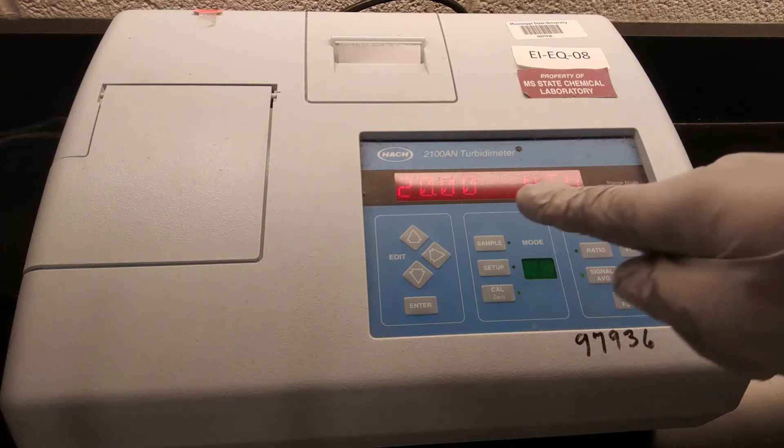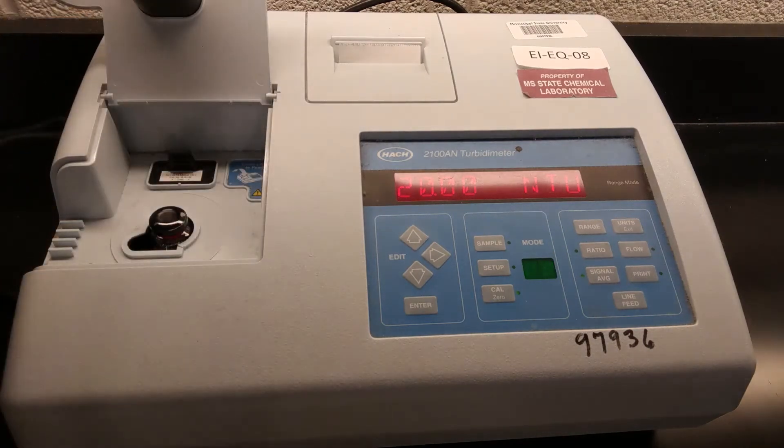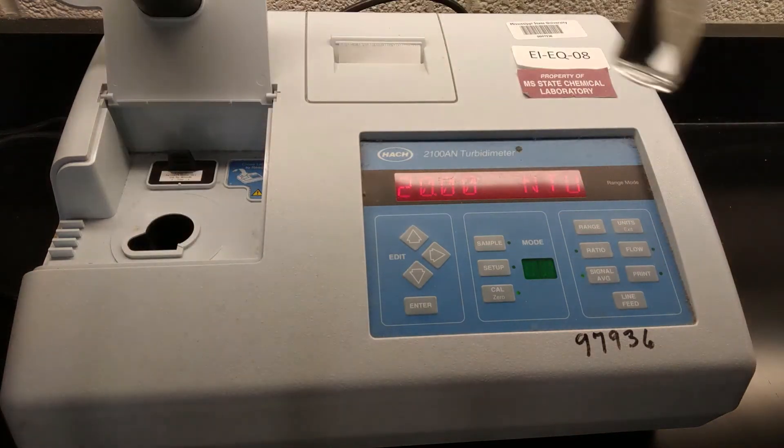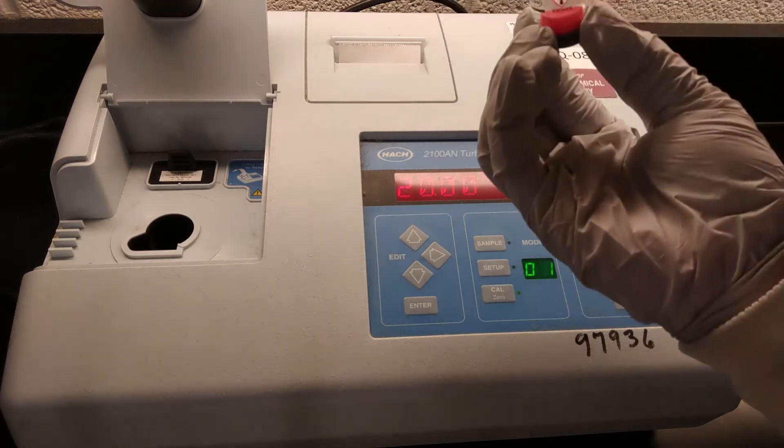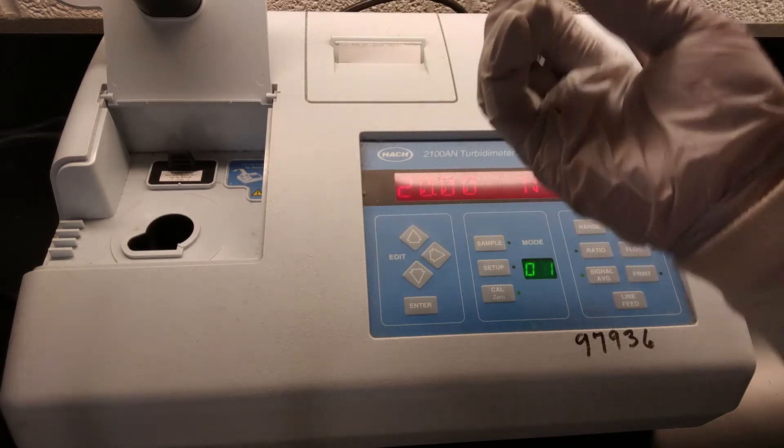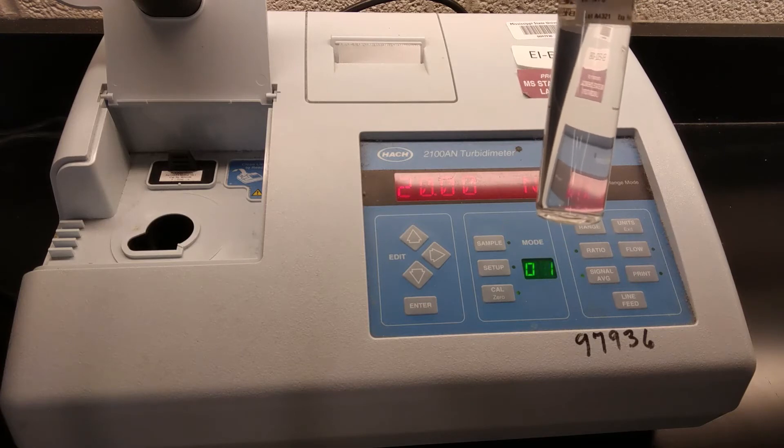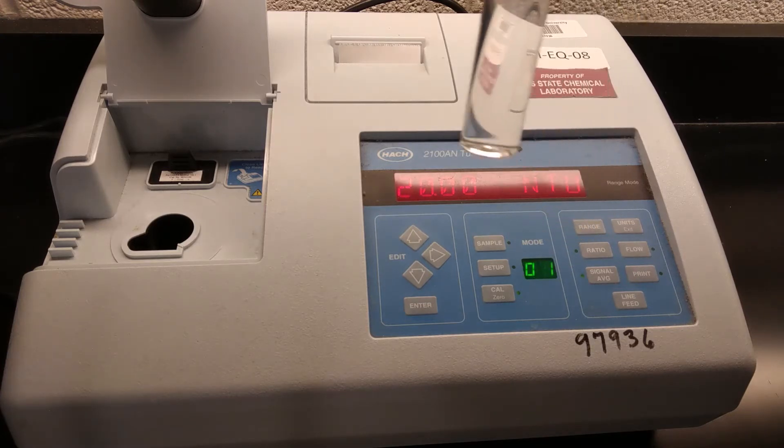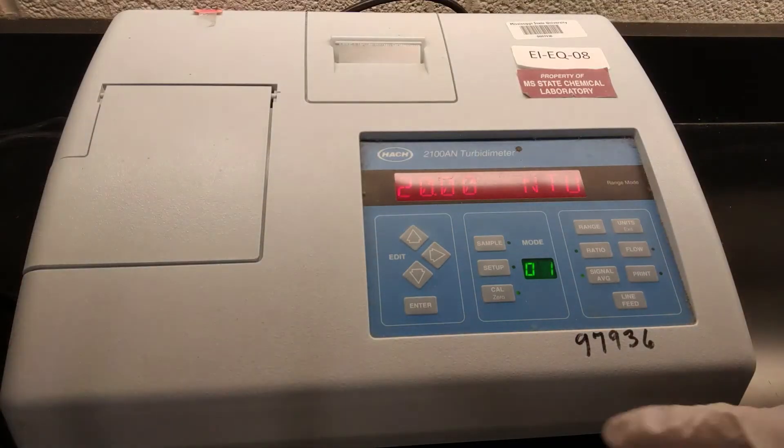Now you can see it's giving me the message 20.00 NTU. So that's what it's expecting. I'm going to take the less than 0.1 out, put that back in its case, and then I'm going to put in this 20 NTU standard. And actually when I took it out just now, it had some visible chunks in it. So I gave it a little bit of an inversion. Just shake it up and make sure that the suspended materials in there are all evenly distributed. So that's going to go in the cell. Close that and hit enter.